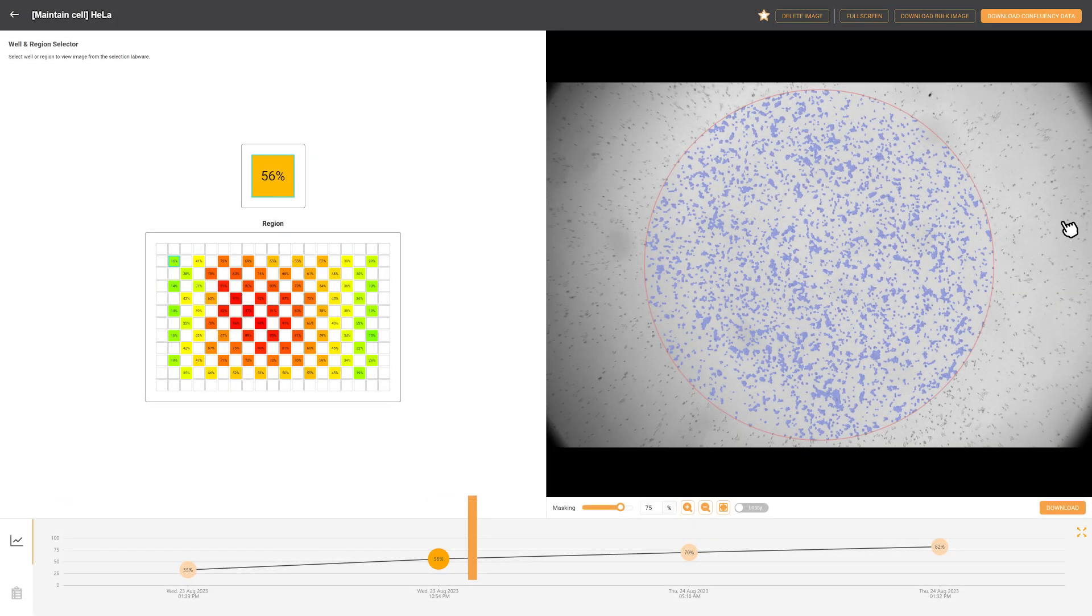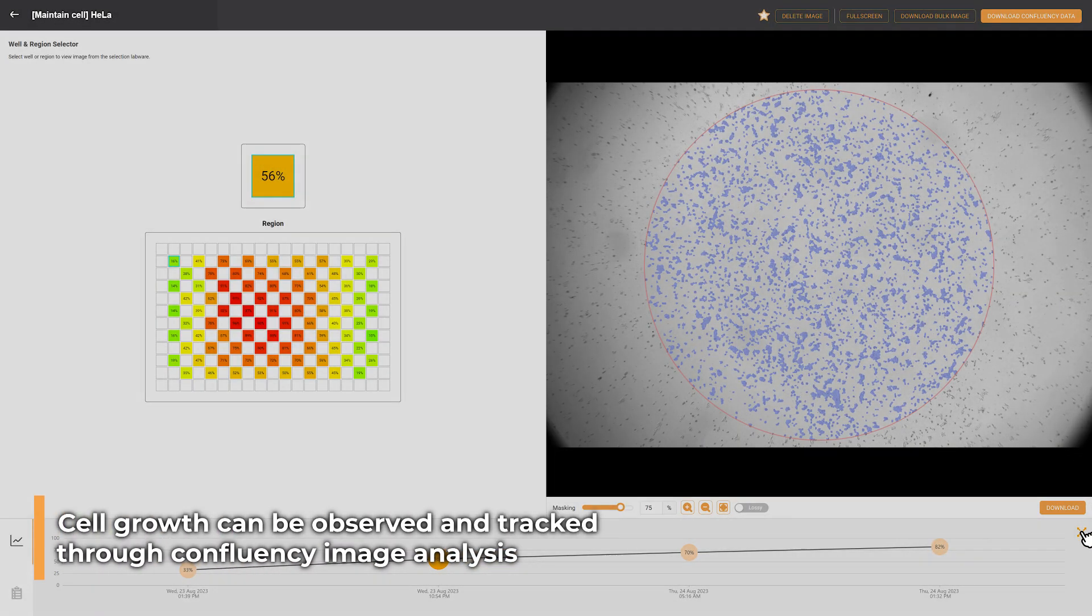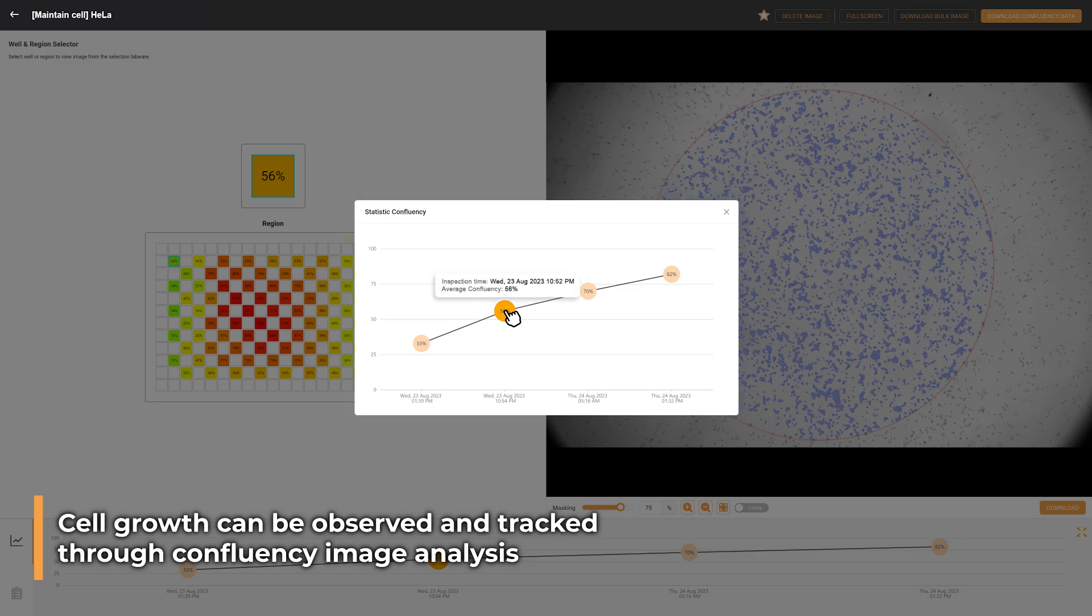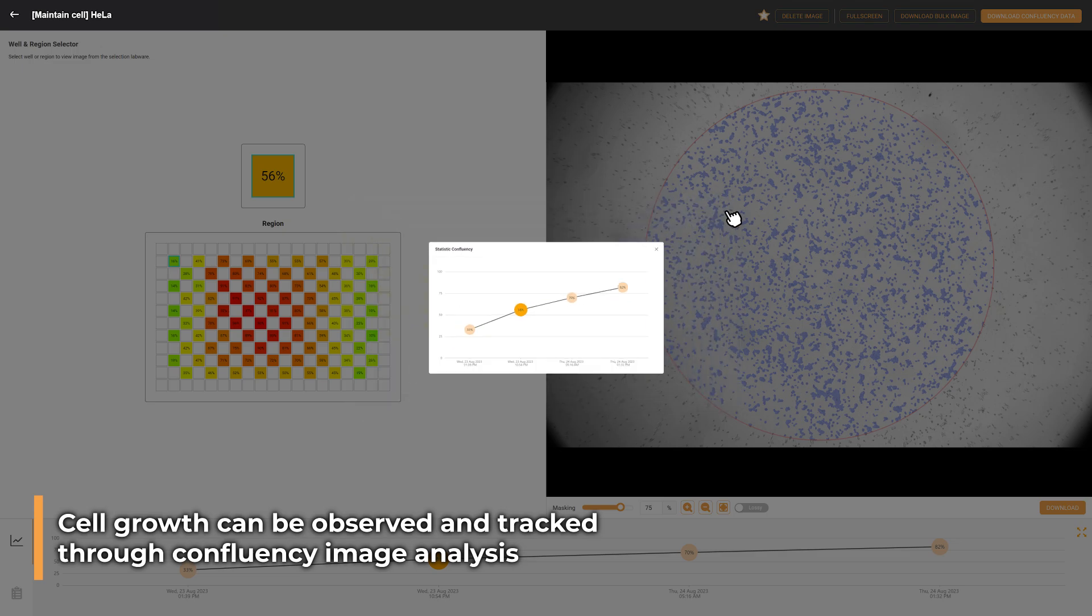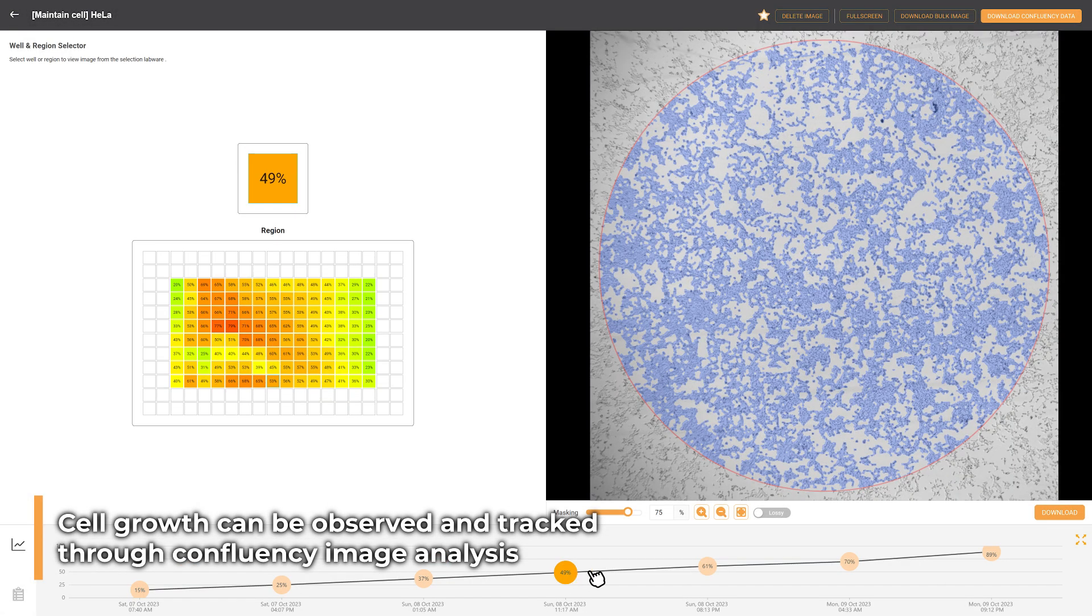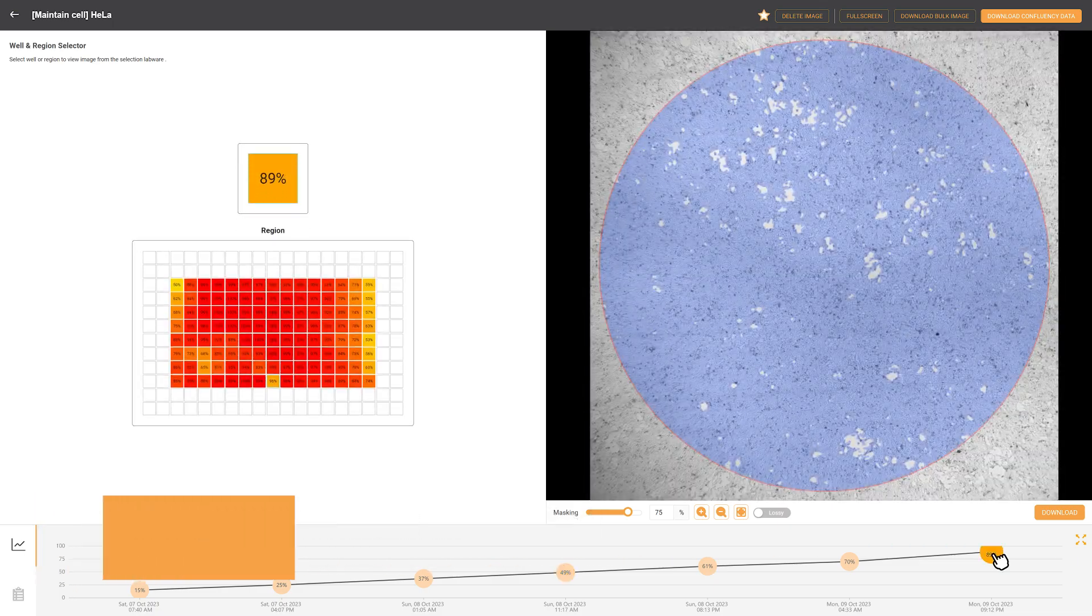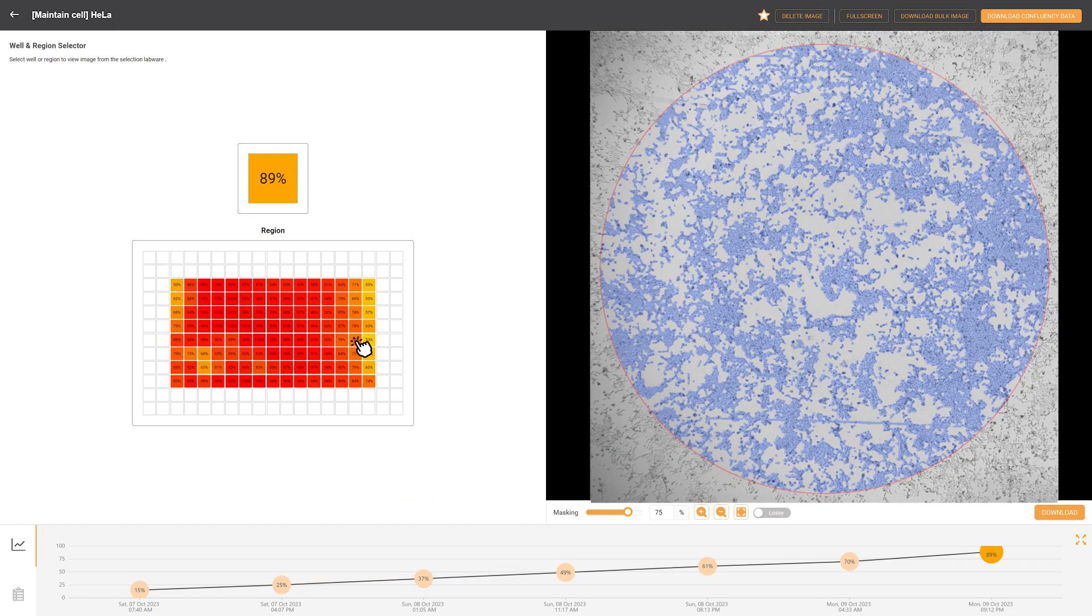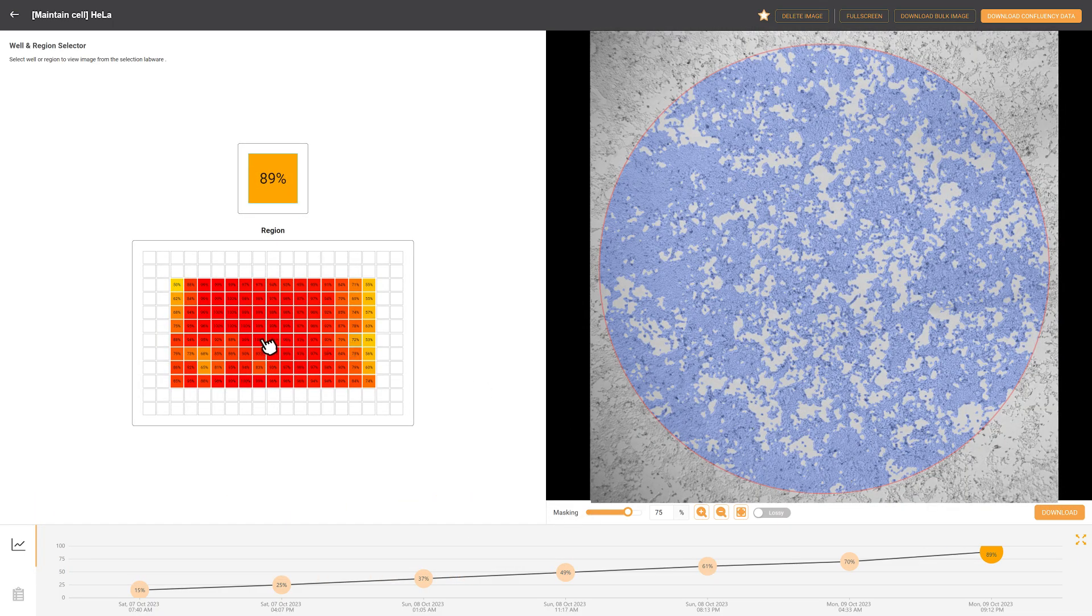Users can easily observe the cell growth from the overall confluency image over time or confluency in specific different regions. To learn more, visit formulatrix.com.